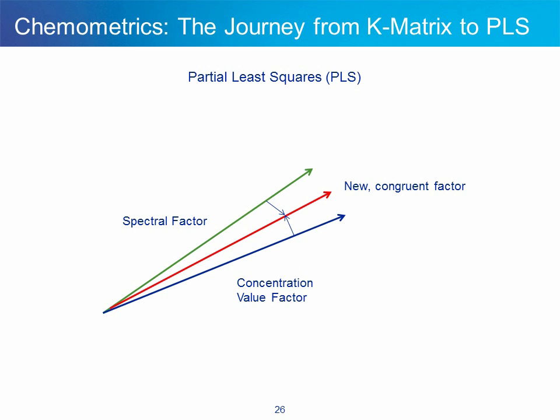Using PCR, we use factors derived from the absorbance matrix, but we use the concentration numbers as is. In partial least squares, or PLS, a set of factors is derived for the concentration numbers as well. This allows noise to be rejected from the concentration data block. Further, it allows an average of sorts between factors from both data blocks, which will give us additional signal to noise.